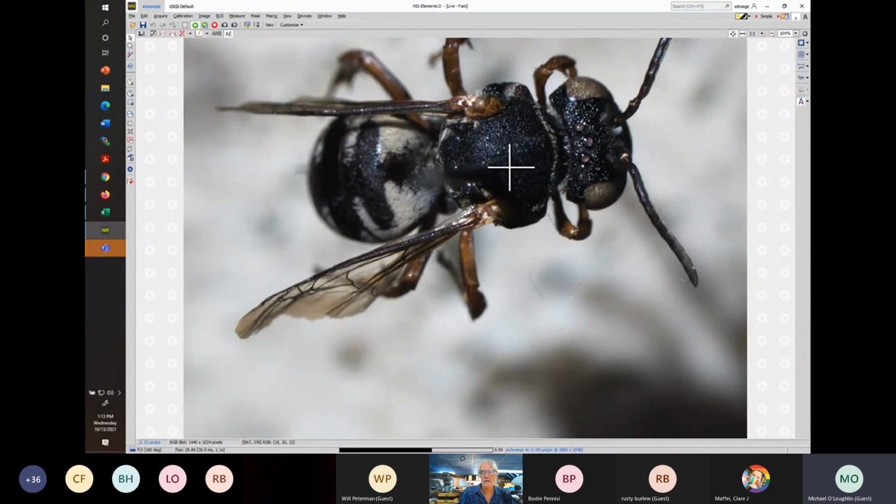One of the issues often is that fluids from the specimen will leak out of the pinhole and cover these short appressed hairs, turning them essentially black. I don't know if that's the case here, but a lot of times any little bit of goopiness will essentially erase these appressed hairs from obviousness. Usually you get a sense that there is something going on because it's not complete.